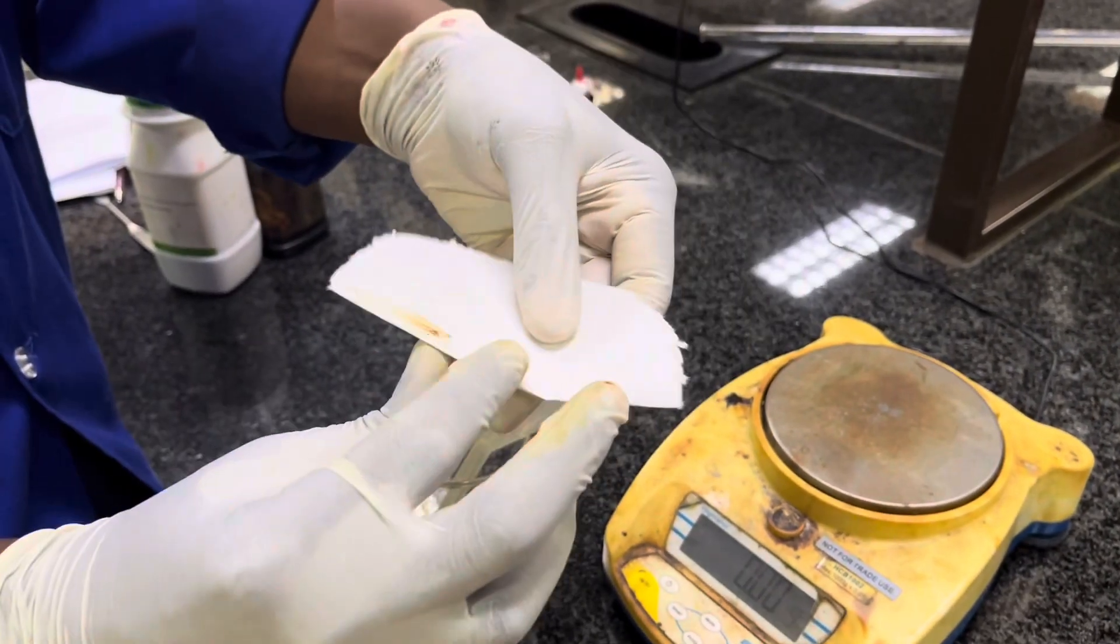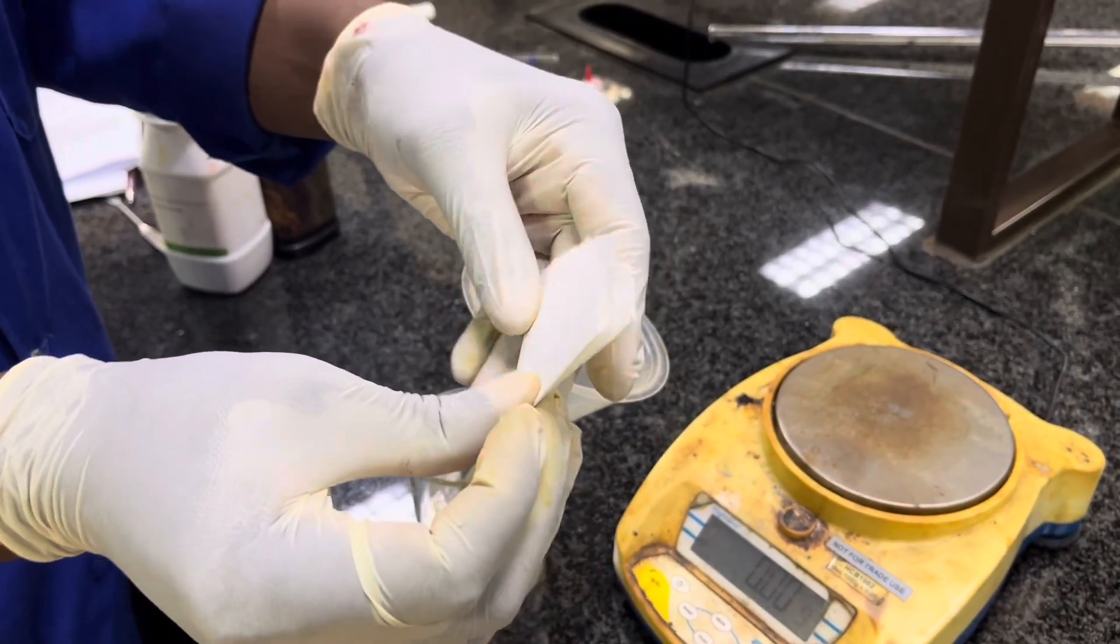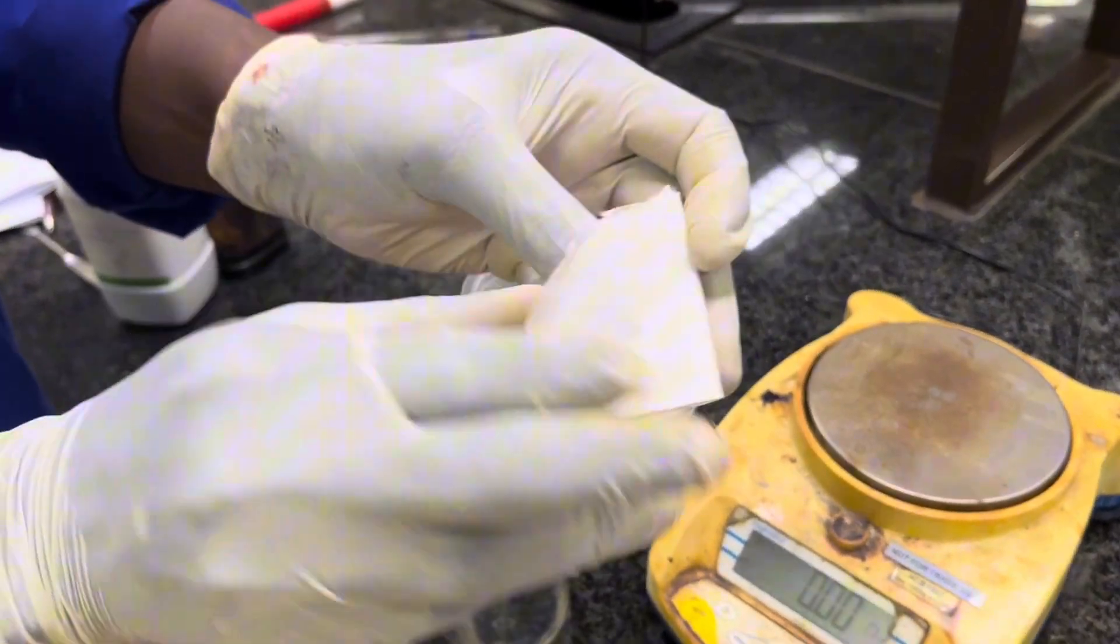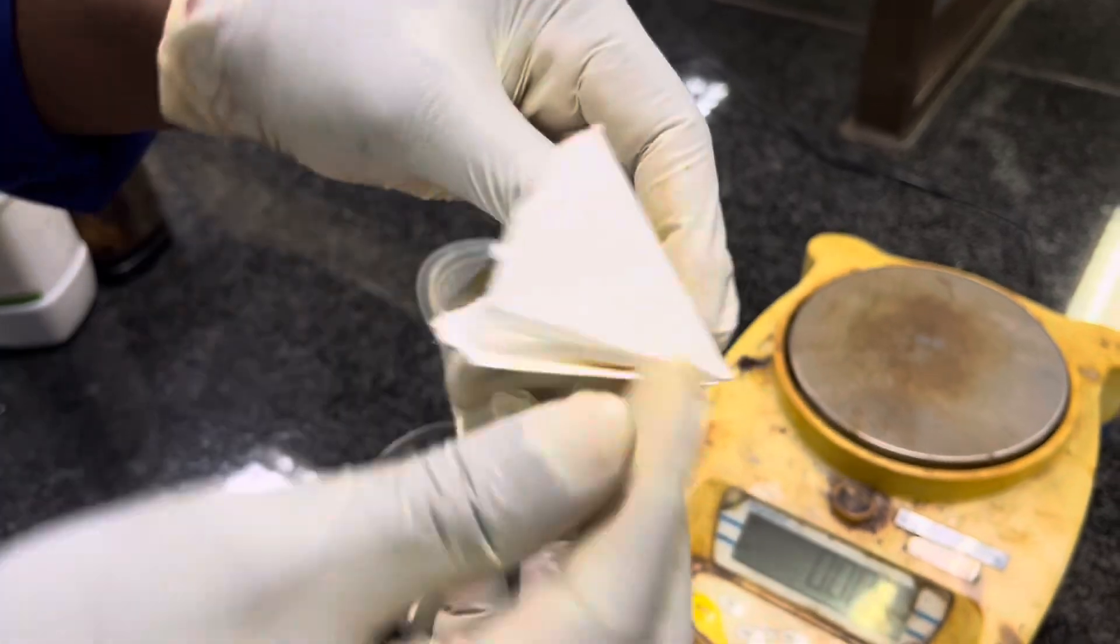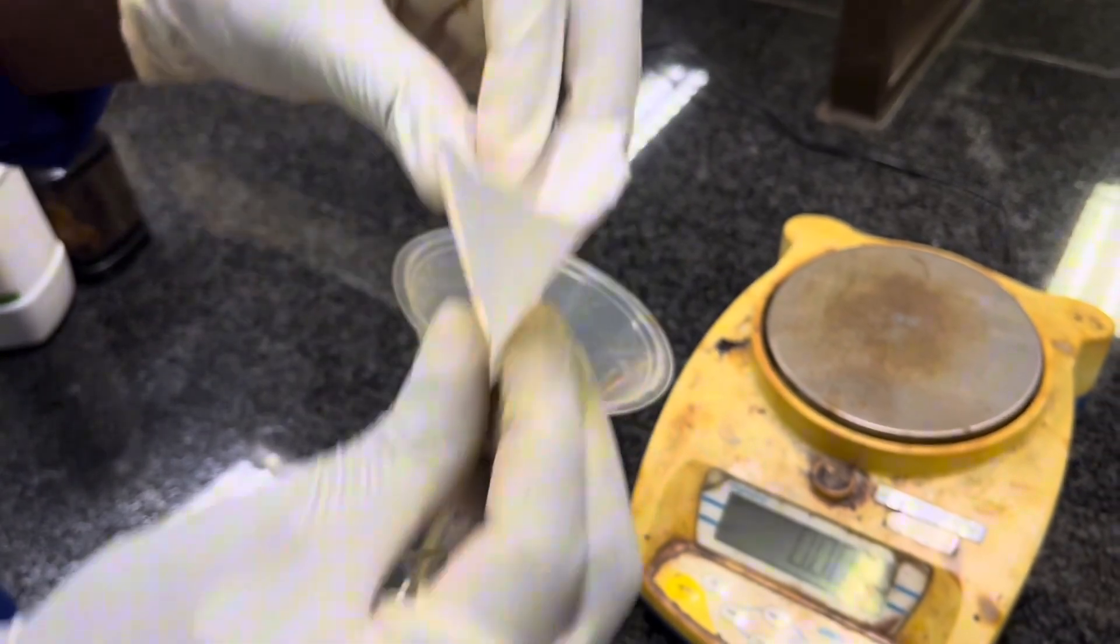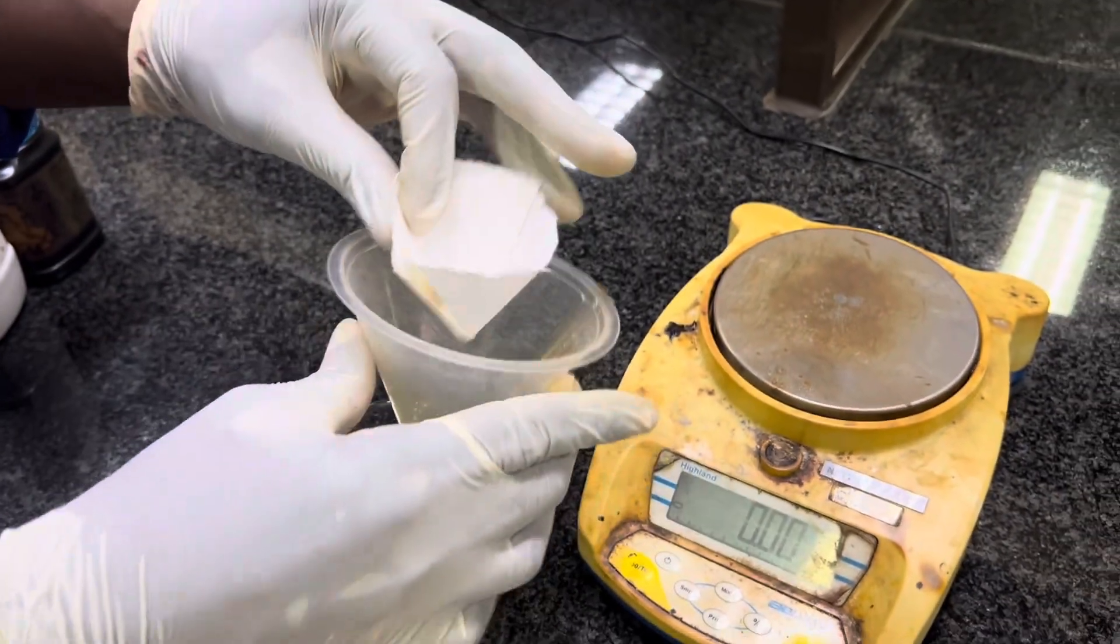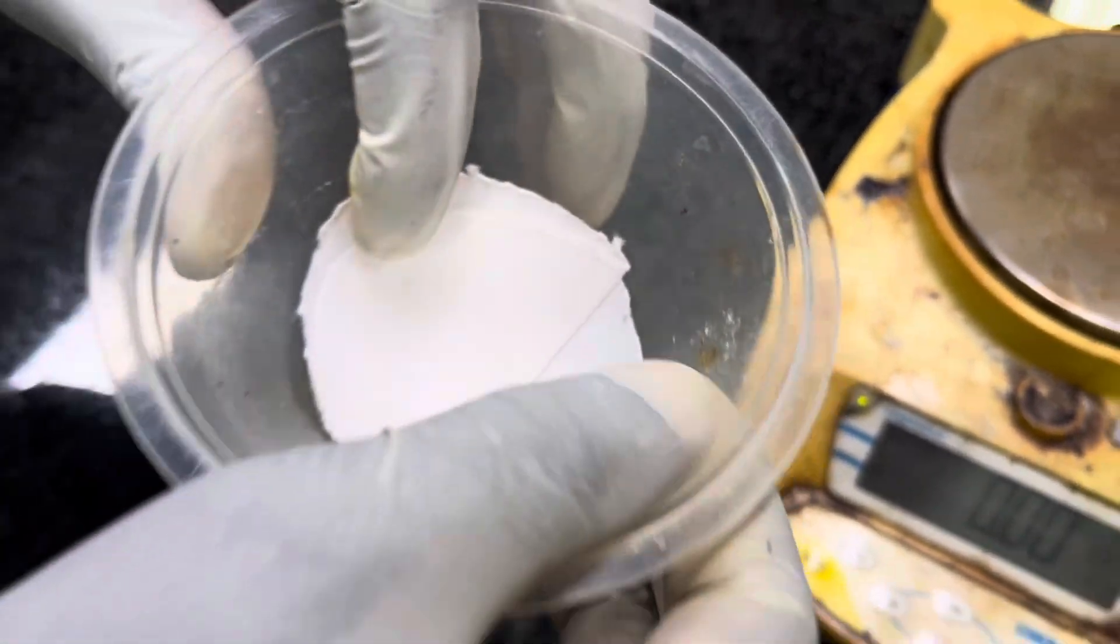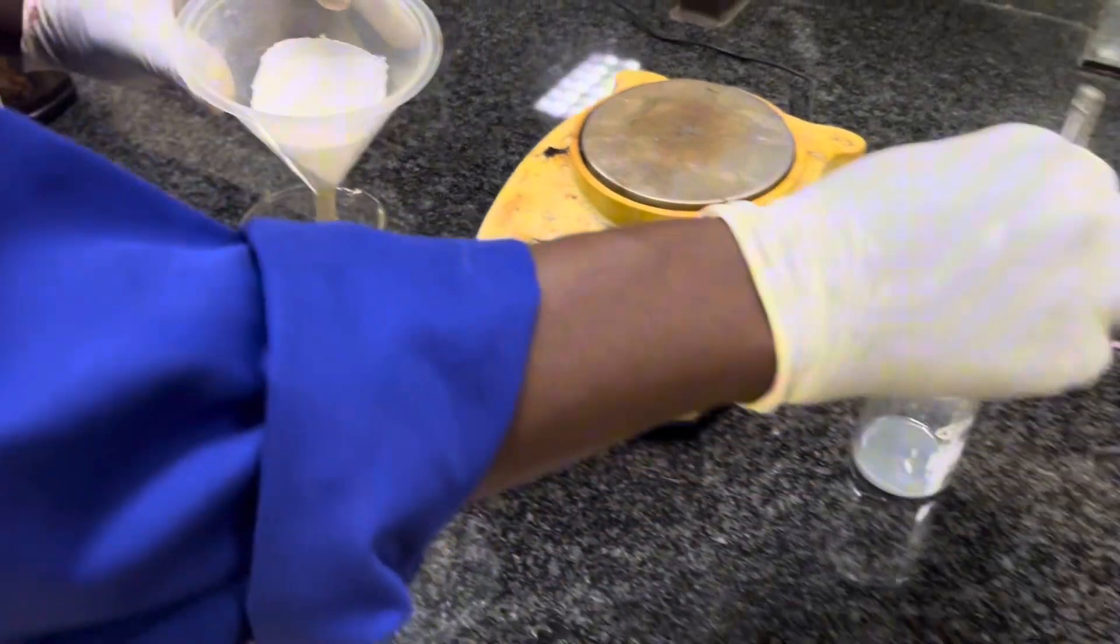From there, we're going to fold the filter paper. Let's fold it in half, then quarter it. From there, we can design it in a manner that it will look like a funnel. From there, we're going to put it on our table.